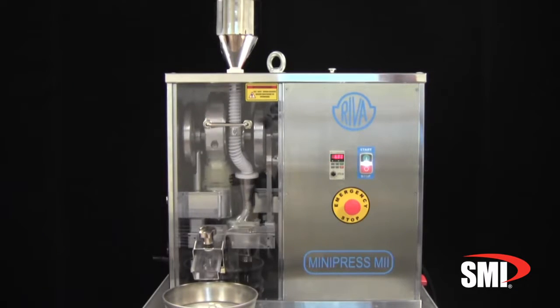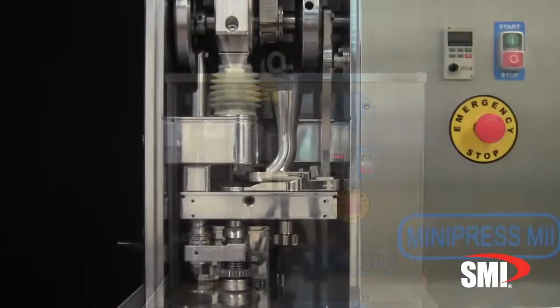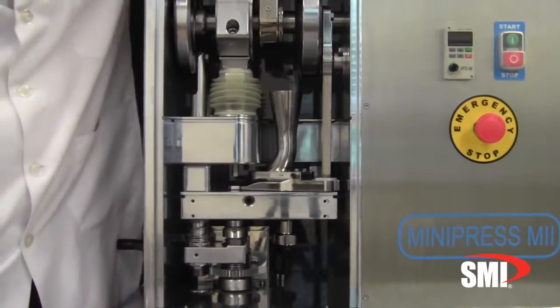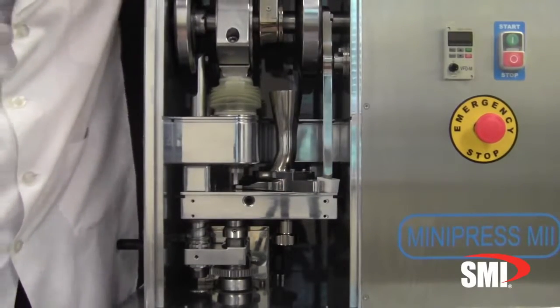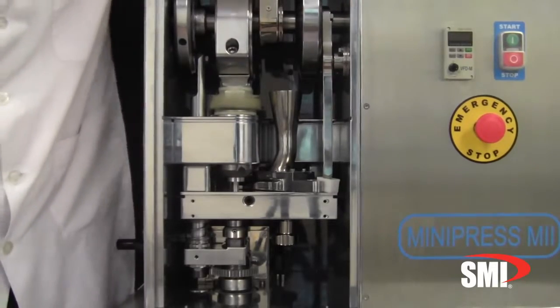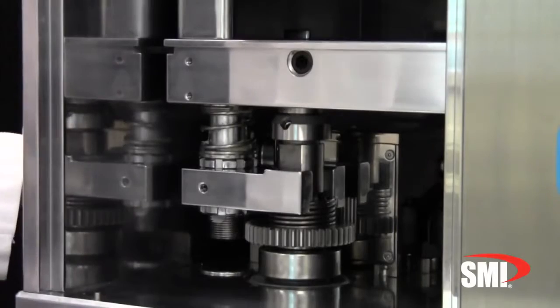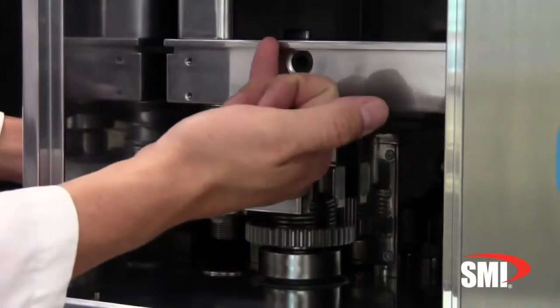Among its many unique features are chrome-plated steel construction and stainless steel contact parts, gravity feed system, wide range of speed from 10 to 100 RPM, and variable weight cam adjustment up to 18mm of maximum fill depth.